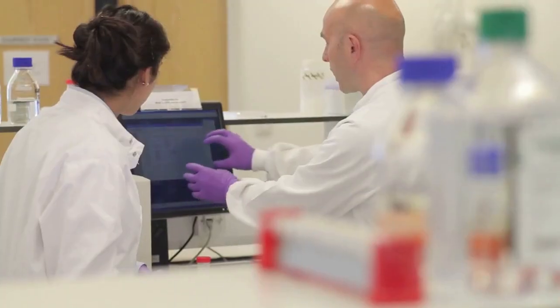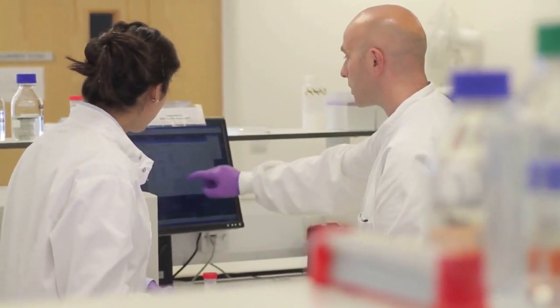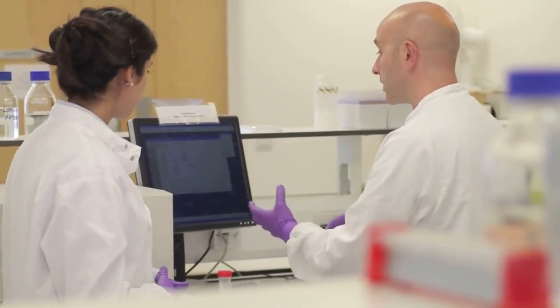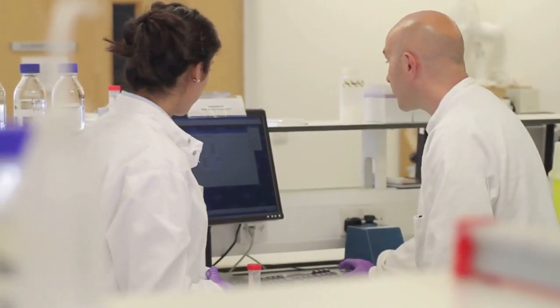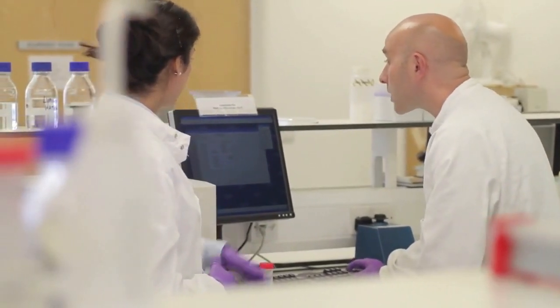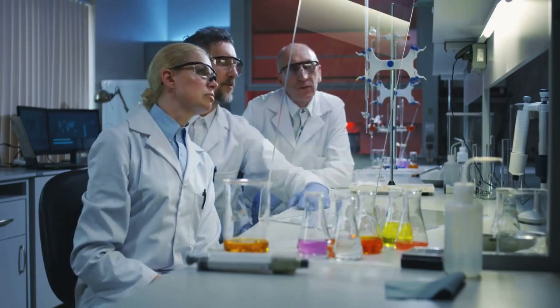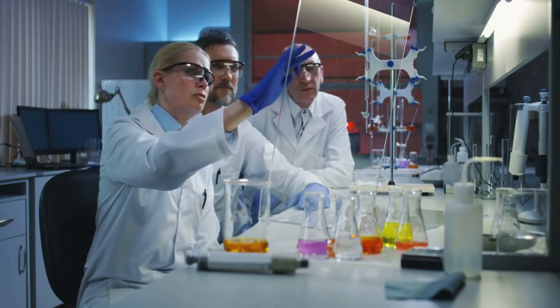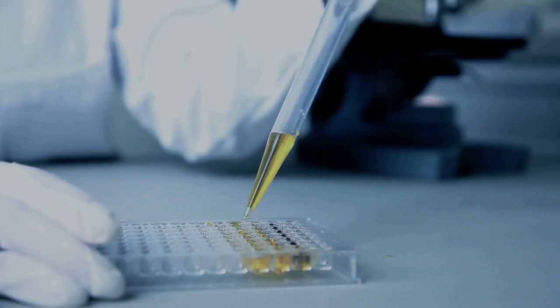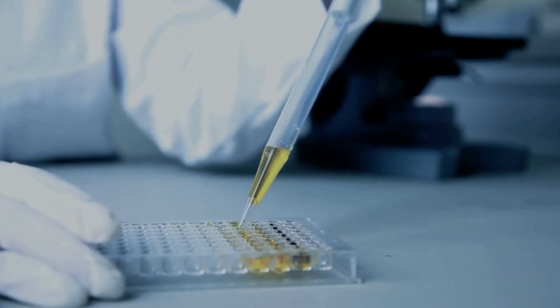analysis. Imagine your GC detector is like an audience watching a talent show. Some performers, which are our chemical compounds, are naturally more charismatic and get a huge applause, which is a large peak area. Other performers are quieter and get a much smaller applause, or a small peak area, even if they are all putting in the same amount of effort, meaning they have the same concentration. Your detector simply does not see or respond to every compound equally.